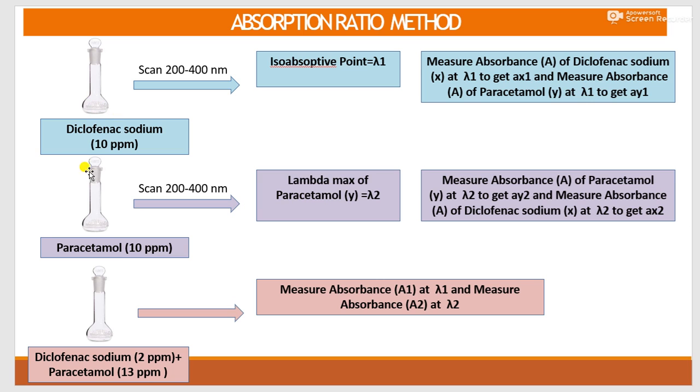So we have 3 solutions with us now: diclofenac sodium 10 ppm standard solution, paracetamol 10 ppm standard solution, and the sample solution, that is the tablet powder solution, 2 ppm and 13 ppm. Very important point, all the solutions need to be filtered during preparation. Sonication is important and filtration of the sample is important, especially in the sample part, because our tablet will have many other excipients, so filtration is a must.